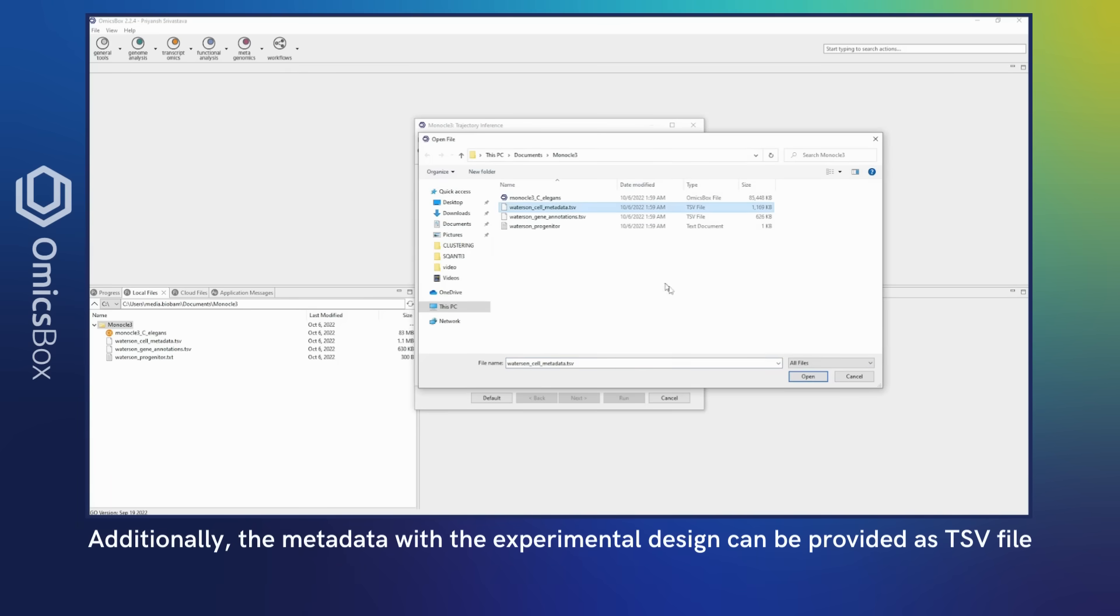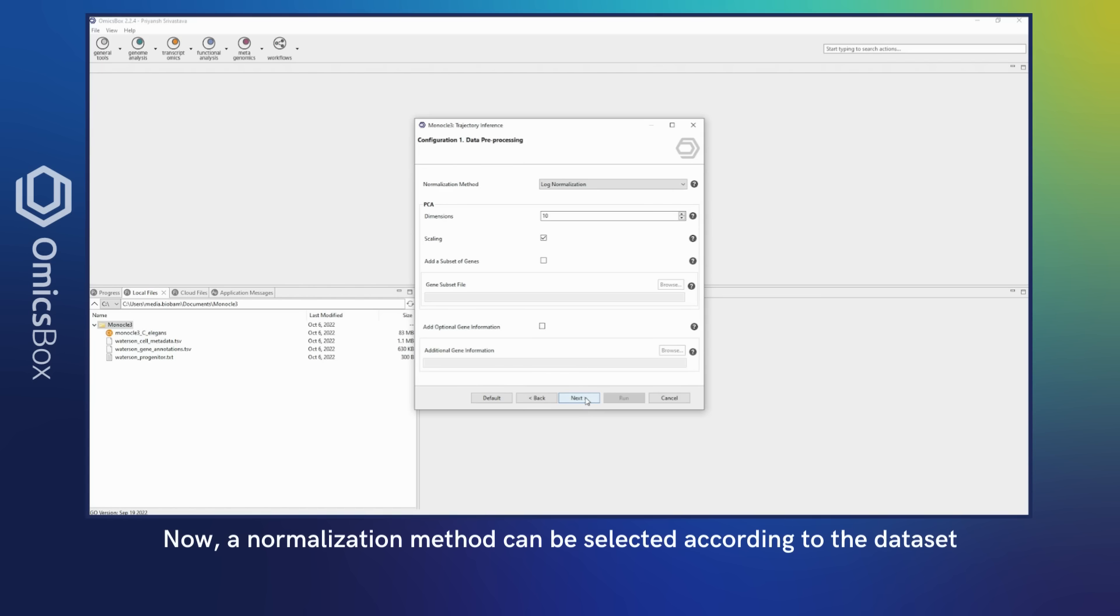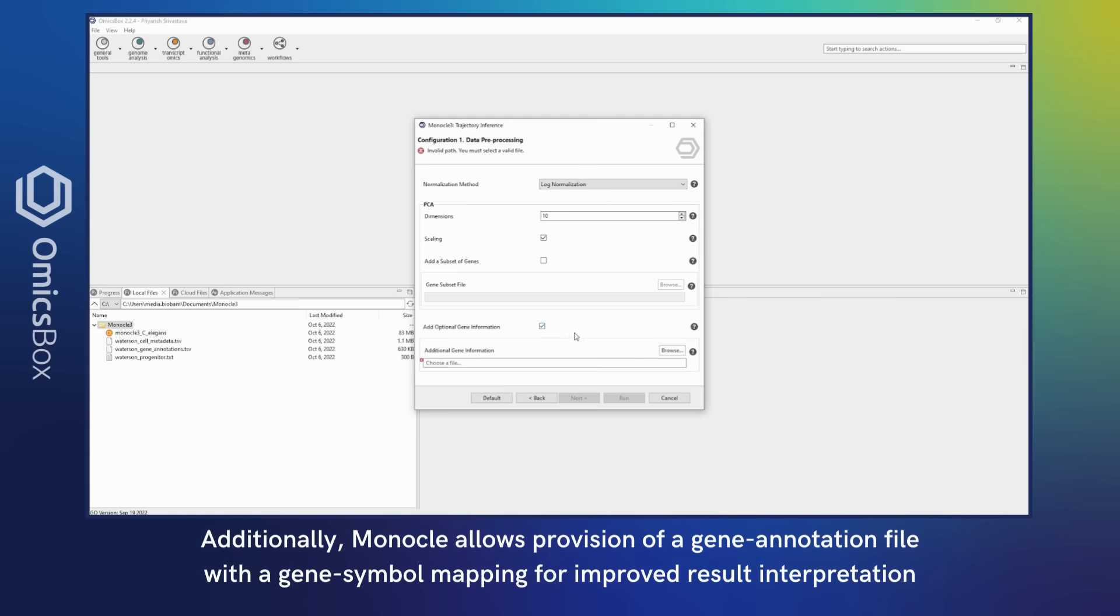Additionally, the metadata with the experimental design can be provided as a .tsv file. A normalization method can be selected according to the dataset. It's possible to adjust the number of dimensions for the PCA based on the number of cells.